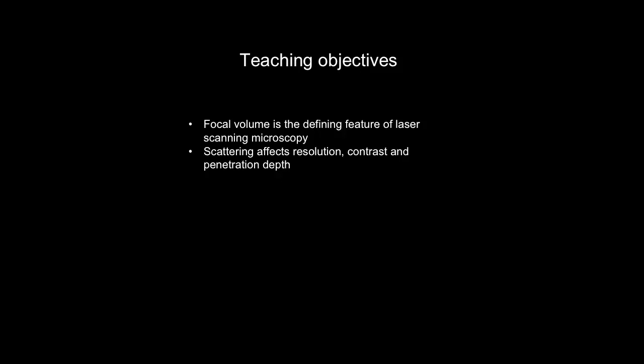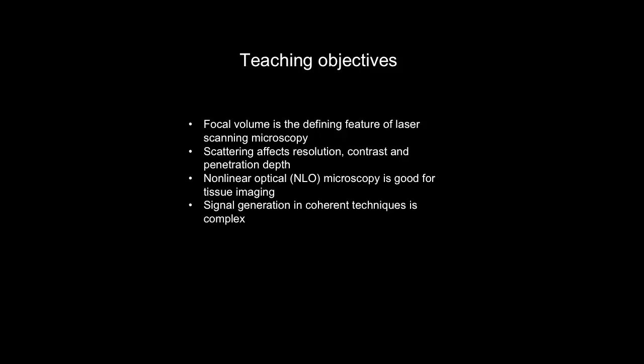We'll learn about scattering and how it affects resolution, contrast, and penetration depth. We'll learn that nonlinear optical microscopy is good for tissue imaging, and that signals generated in coherent techniques are complex.